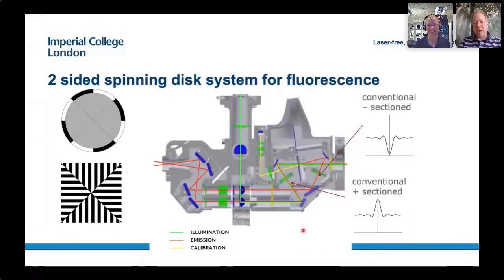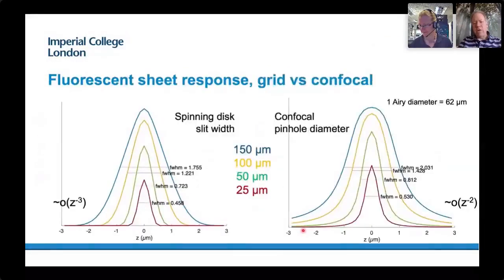Because as far as I understand it, they typically use an array detector instead of a pinhole detector, so they are detecting this out of focus light. What an Airyscan is doing is giving you an effective pinhole diameter which is small, although it's collecting more light by collecting it over a larger area.